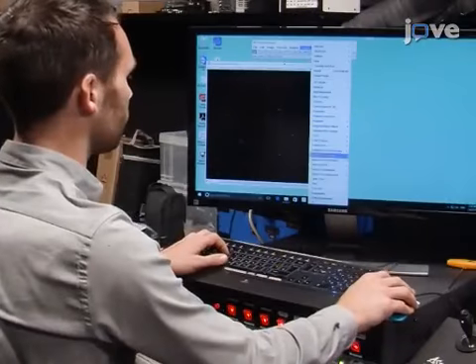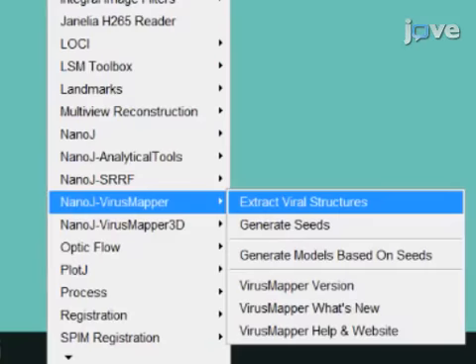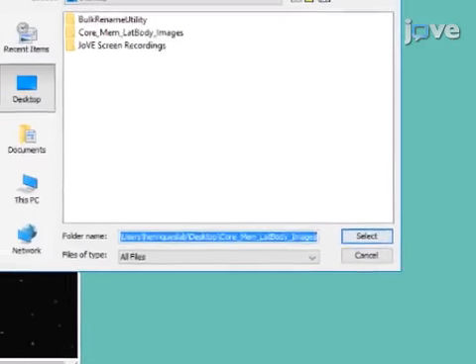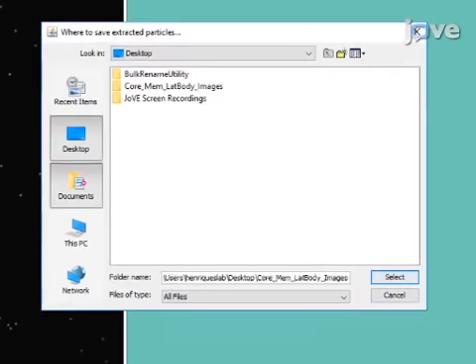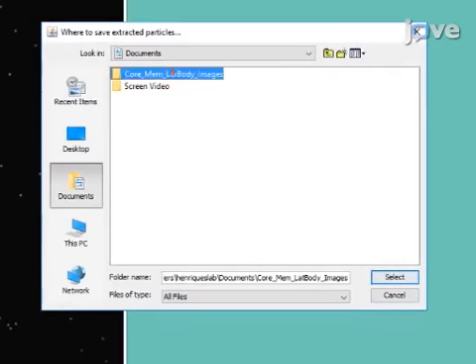Next, select Extract Viral Structures in the Virus Mapper submenu and set the file path for the extracted particles.